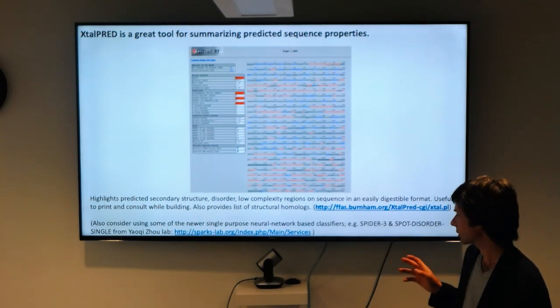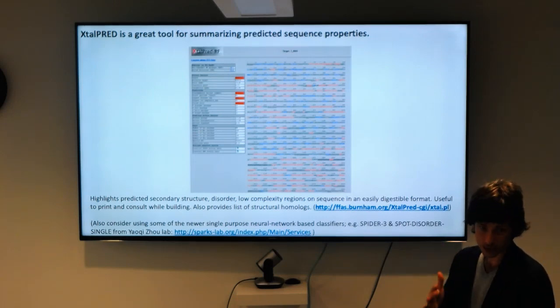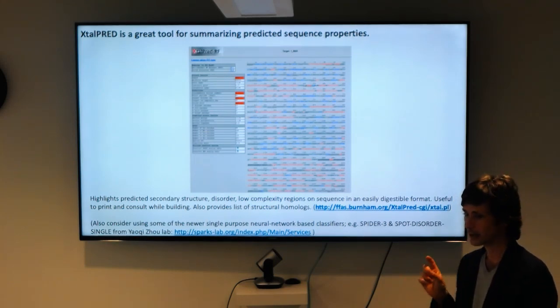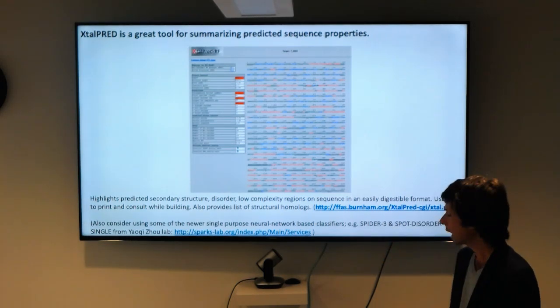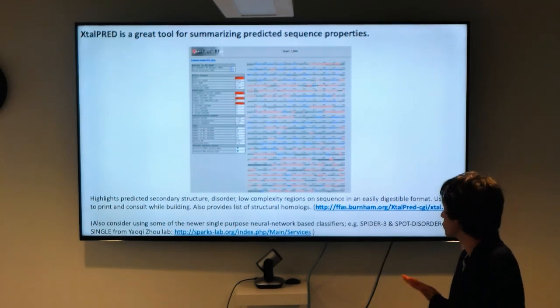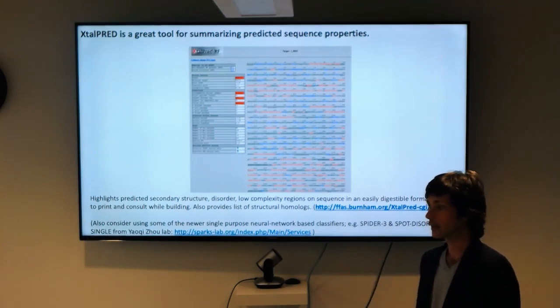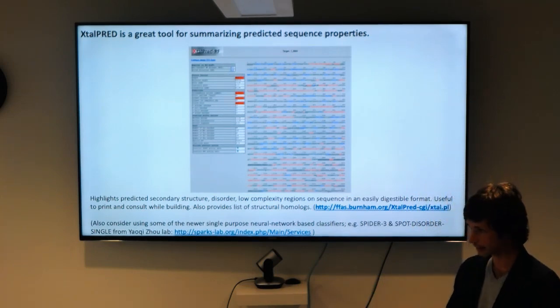The reason why this is really useful is that secondary structural prediction is actually extremely accurate. So it's a very strong constraint on your model building. JPred, I think, is like 82% accurate, and some of the newer neural network models, like Spider-3, for example, more like 85 or maybe even higher percent accurate. So what that means is if you encounter something that in the sequence is strongly predicted to be an alpha helix, but you're not seeing alpha helical density in the map, it's an indication that you probably built it wrong, and that you should maybe reevaluate whether your sequence register is correct in that case.